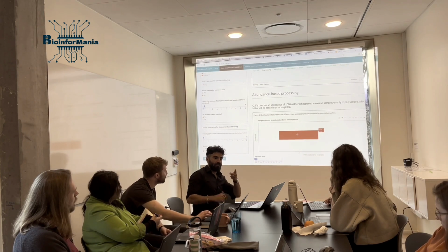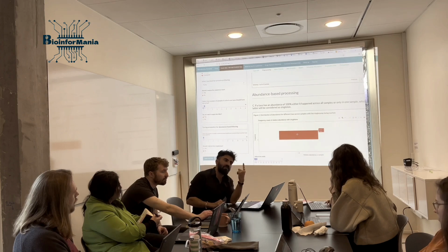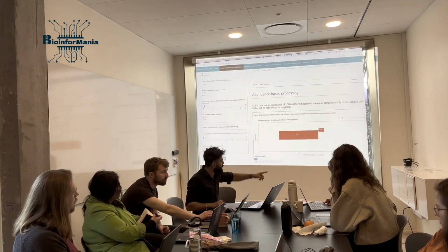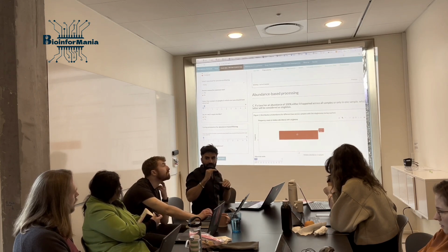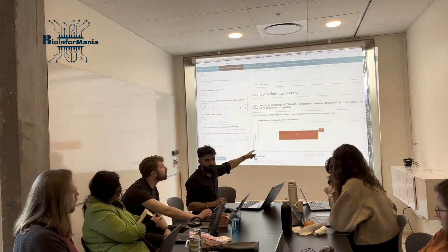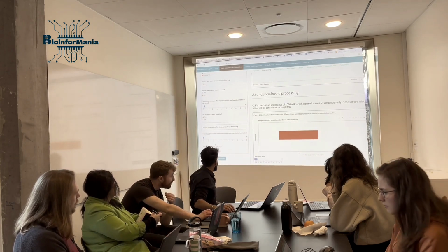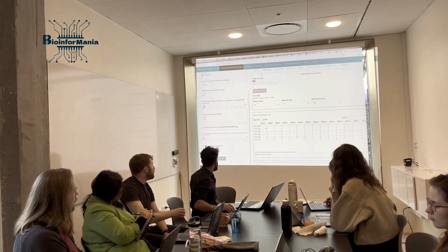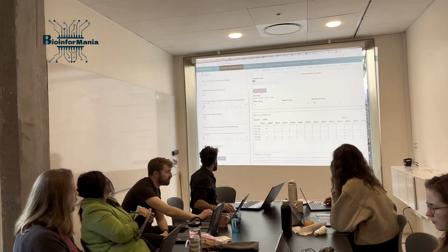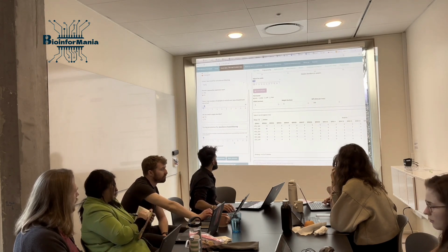It can tell you 2 things. One, either it has occurred across all the samples, or it has occurred only in one sample. In this scenario, the algorithm checks for the second. If the second holds true, then we remove it. Otherwise, it doesn't show it as a singleton here, okay? So no worries. Here you can be, again, very careful, depending on your design. I just selected yes, and then you can either apply or skip processing. If it's a pilot study, you can skip, you can set most of these to no.